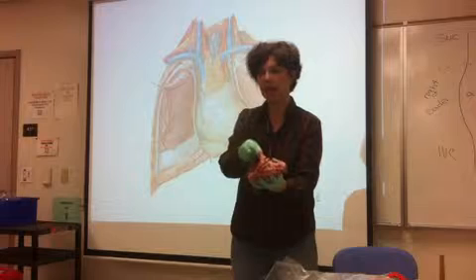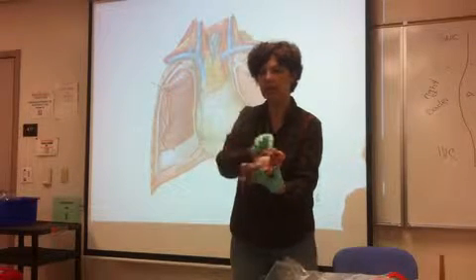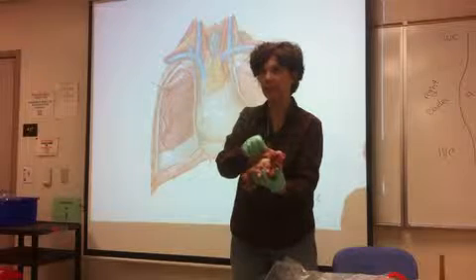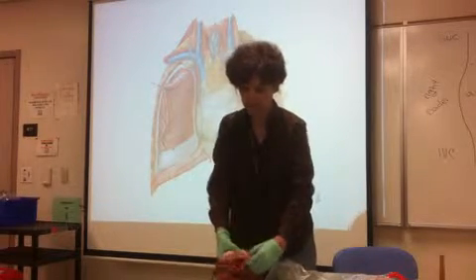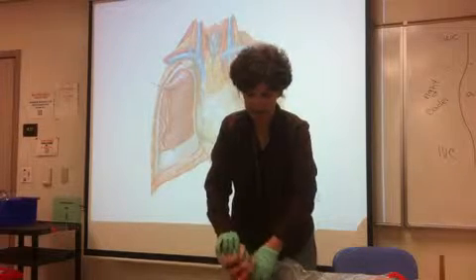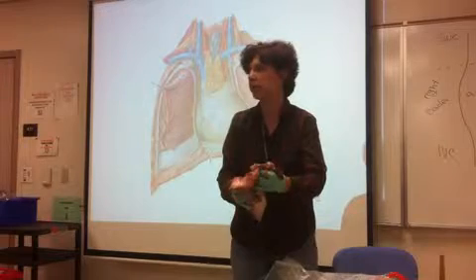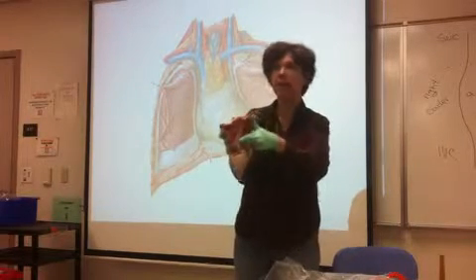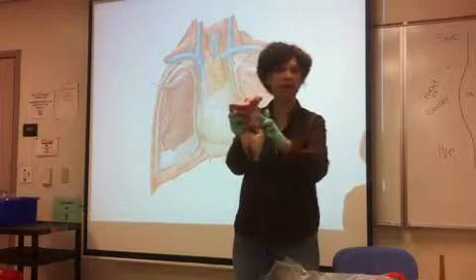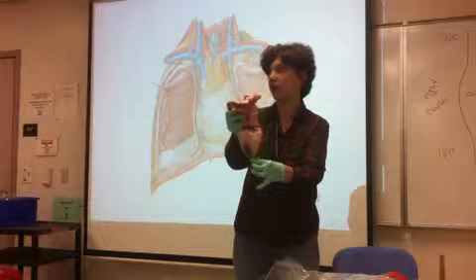All right? So I cut it, and now my hand is in the pericardial cavity. So if I completely undo it, here's the heart, and the pericardium is attached at the great vessels. I grew up with banana trees, so it always reminds me of a banana bud, the way it develops. But notice how the inside of the parietal pericardium is smooth and slippery. That's continuous with the surface of the heart.